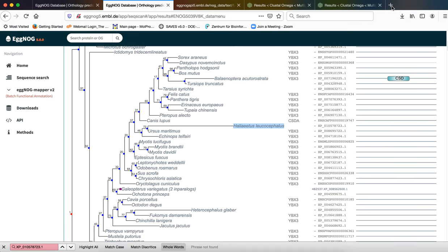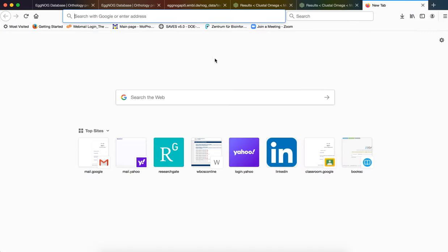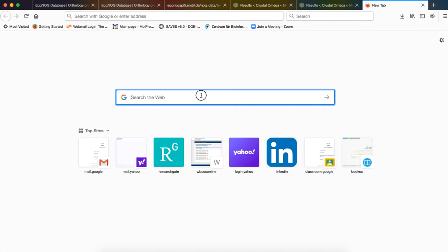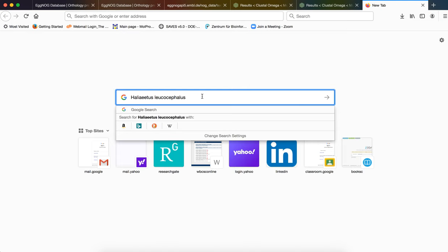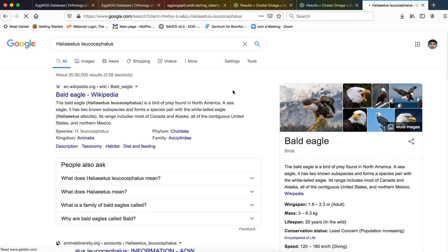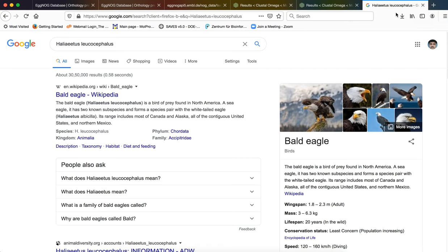So this is the organism which is found to be the most nearest orthologue. So let us search in Google what this organism is. So this is bald eagle. This gives you an information regarding what kind of organism this is.